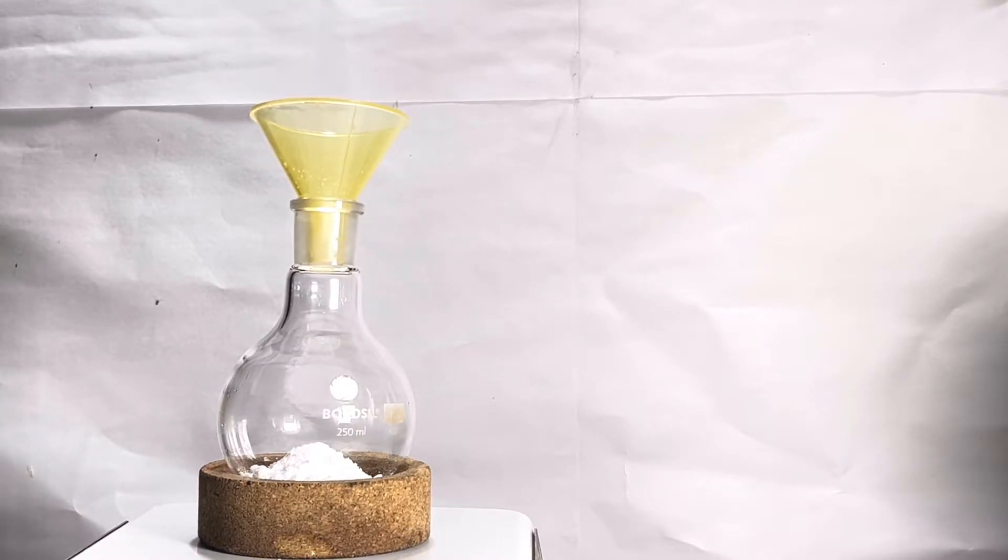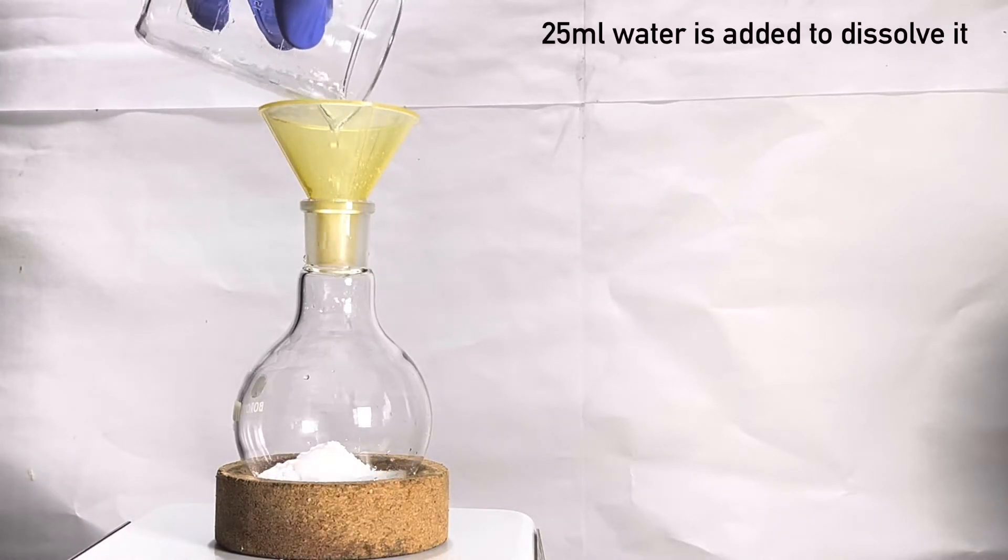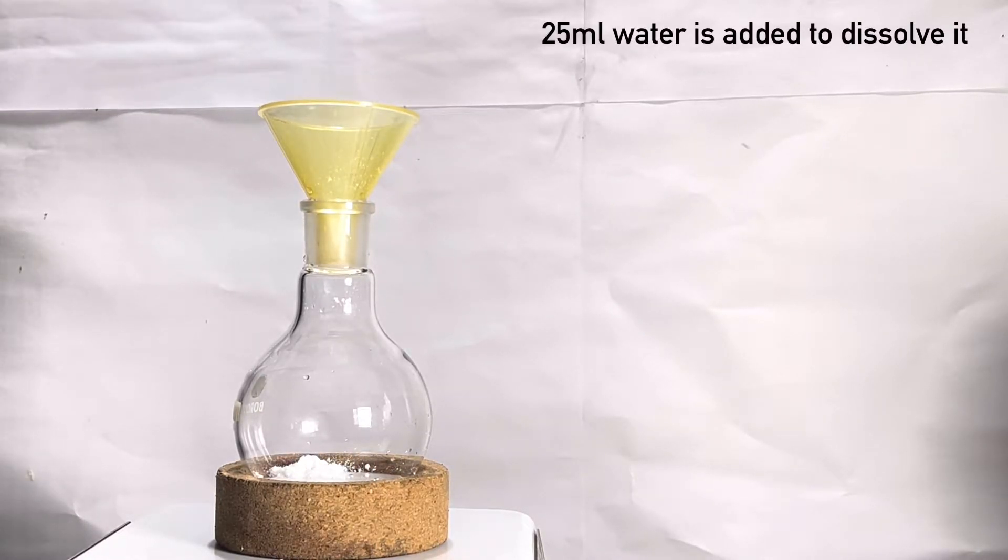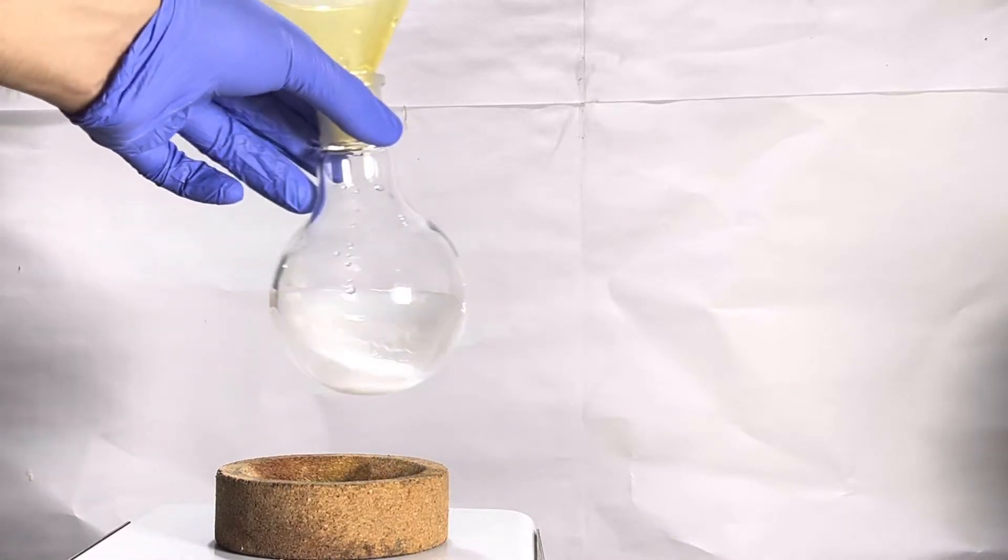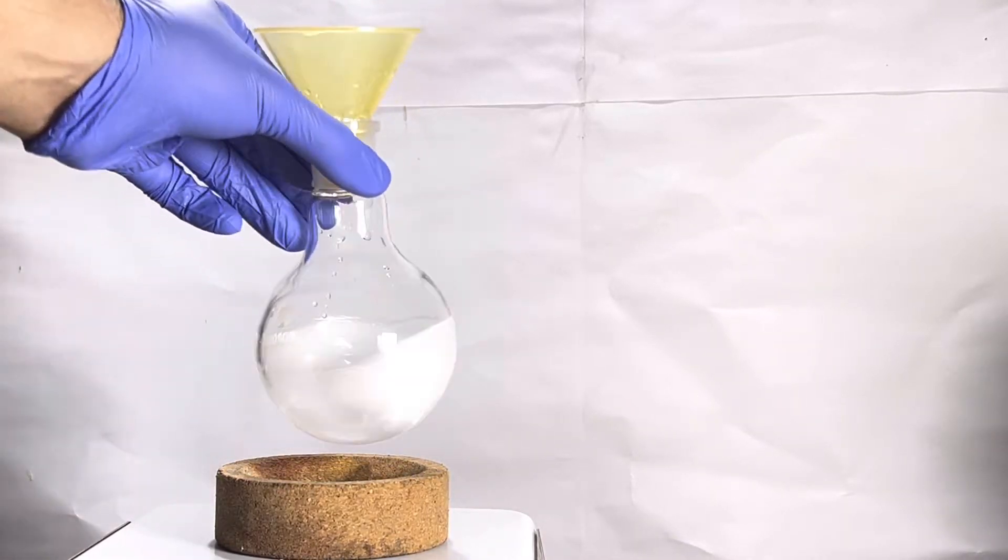Next we add 25 milliliters of water to the flask. Here you can see me adding the water in small portions in a circular motion in the funnel so as to rinse the funnel and wash down everything to the flask. Sodium cyanide is extremely soluble in water. The beaker which contained the sodium cyanide was also rinsed and poured into the flask.